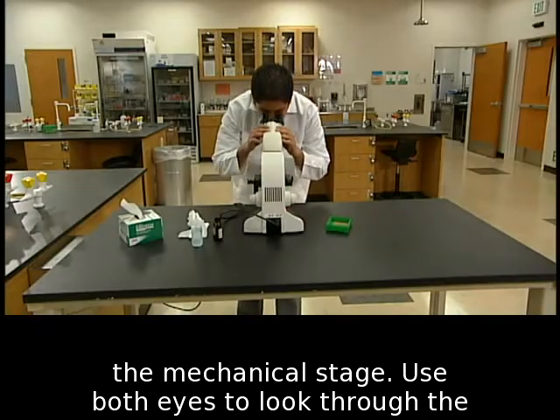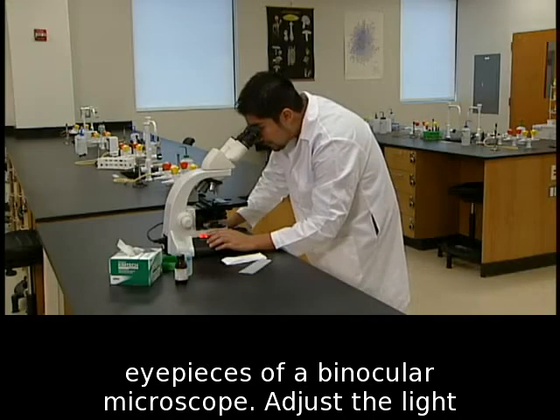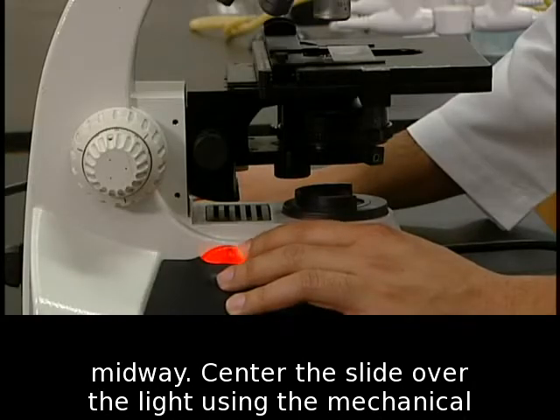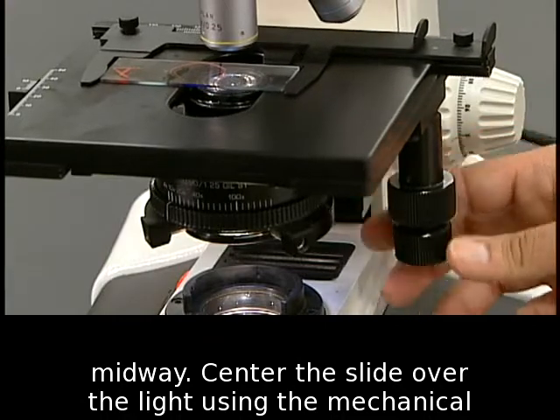Use both eyes to look through the eyepieces of a binocular microscope. Adjust the light intensity to a comfortable level with the dial about midway. Center the slide over the light using the mechanical stage knobs.